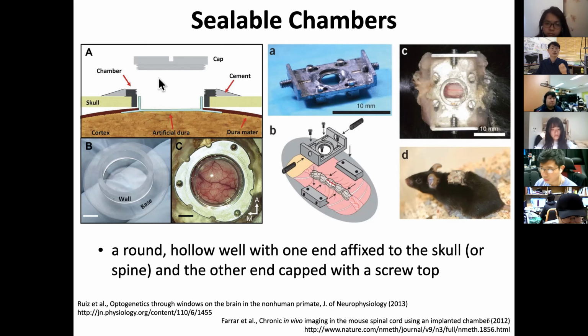Then the question is, when we talk about the central nervous system, including brain and spinal cord, people will also be asking: why not the spine? Can we see the spine in microscopic detail in vivo? The answer is yes. People have created a permanent window on the spine, which came out in 2012 in Nature Methods from Chris Schaffer's group at Cornell University. That's on the right-hand side.